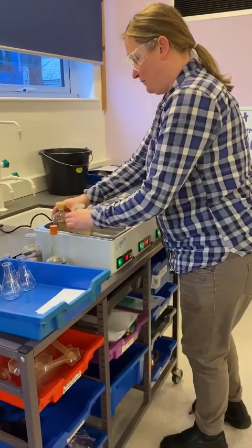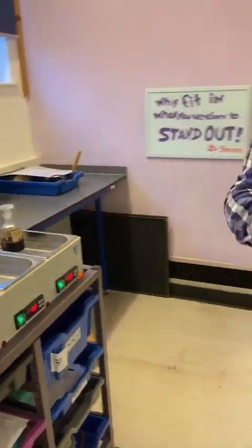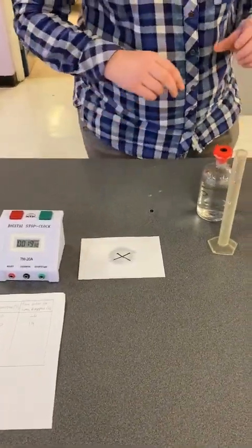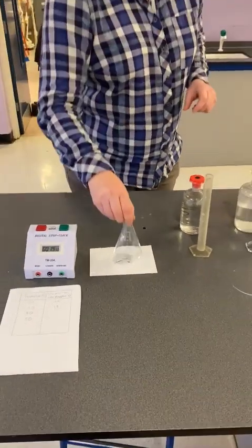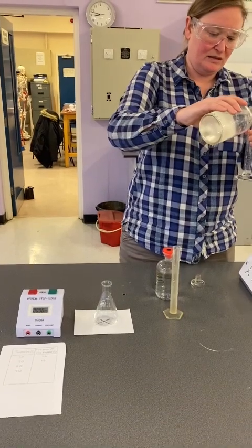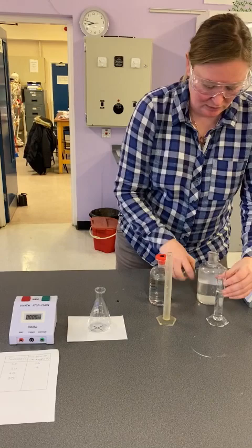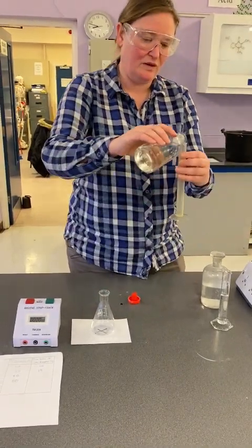This time, we're going to use sodium thiosulfate and acid at 40 degrees Celsius, and I need a new conical flask. Again, 20 centimetre cubed. Oh, that's quite warm.